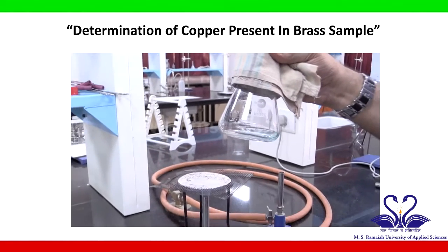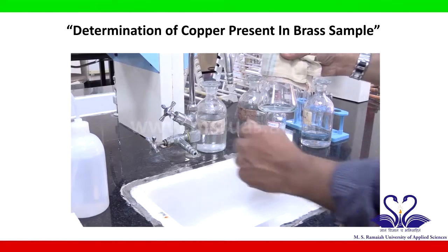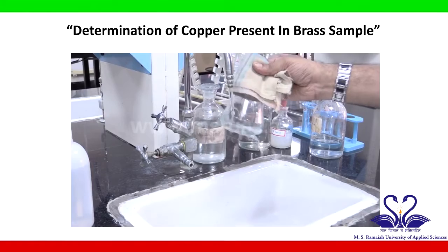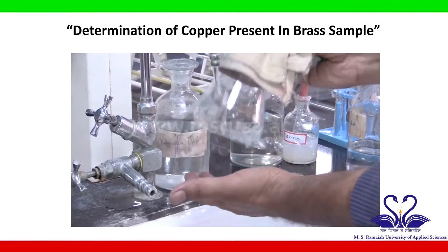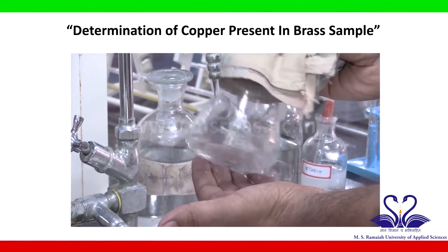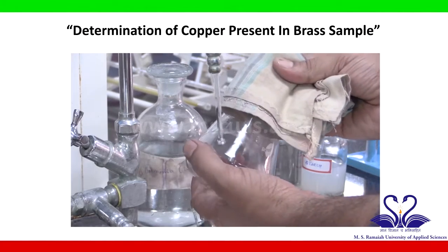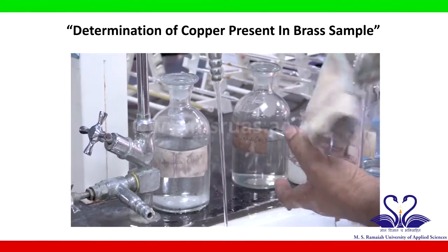Now you have to cool the solution and bring it to room temperature. You can do that under the tap. I am cooling this under the tap. Be careful. Just hold it with your left hand so that you take care. Okay, it is almost cool.